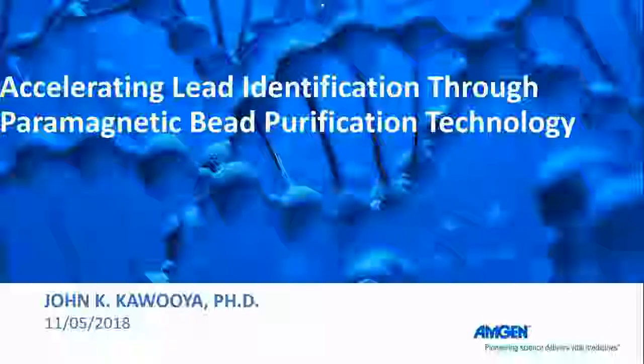Okay, I'm going to present Accelerating Lead Identification Through Paramagnetic Bead Purification Technology, as shown in the title here. So the overview of this presentation is as follows, as you can read down here. What are paramagnetic beads? How are they synthesized? And how are they applied in the magnetic bead purification of antibodies?